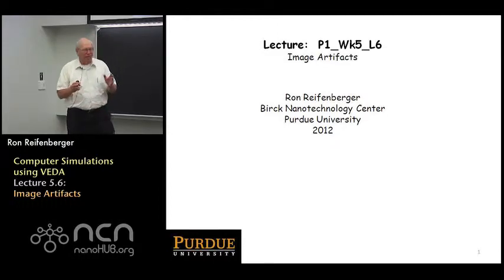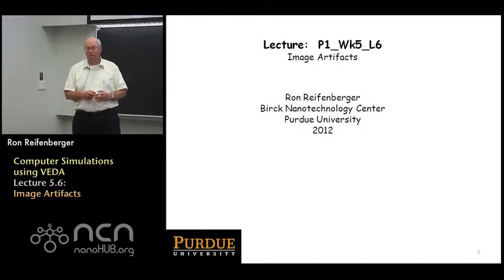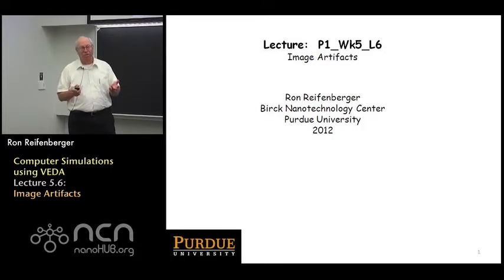I think the main problem with atomic force microscopy is that in principle everything works very well. There's very nice theories worked out to describe what's actually going on, but in practice you never really know what the shape of the tip is when it interacts with the substrate. And this lack of knowledge often causes misinterpretation of experimental data. So it's not only that the data you get is bad, but the data that you get is misinterpreted because you're assuming perhaps the best of all possible cases, when in fact your tip has been contaminated or your tip has actually been blunted by improper use of the instrument.